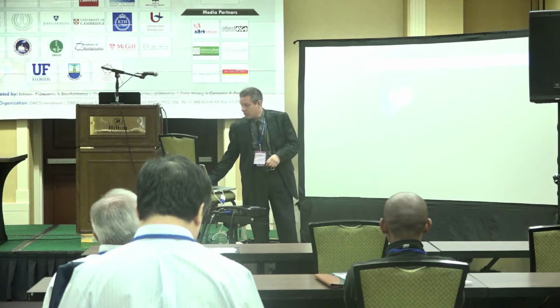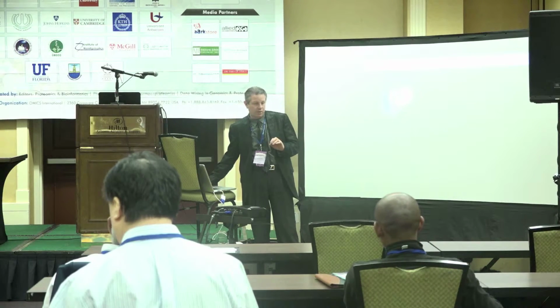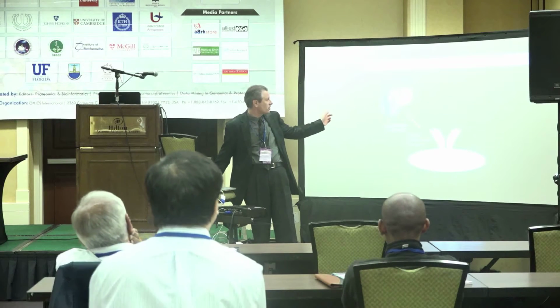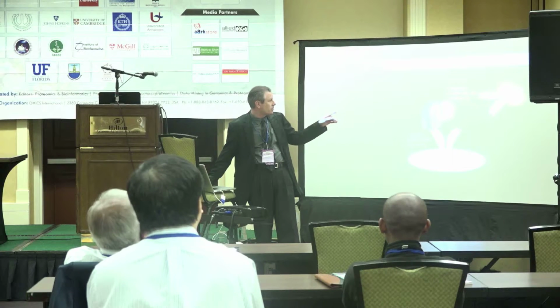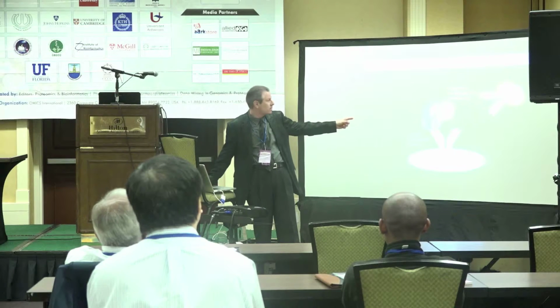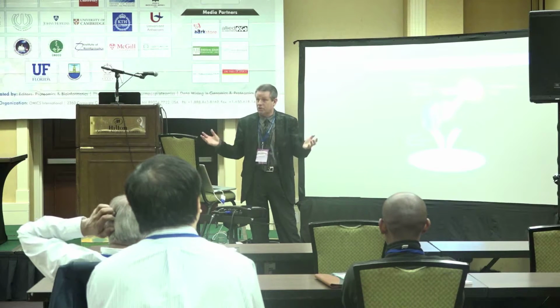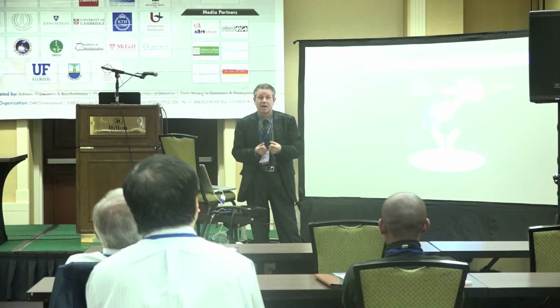You can look to see what proteins might be targeted by a particular adapter or chaperone protein in a model system. So here we capture the complex, and then we incubate with the reporter antibody for the other protein of interest, and then we quantify the signals for that. So this is a way to look at large-scale changes in protein association with specific adapter proteins.